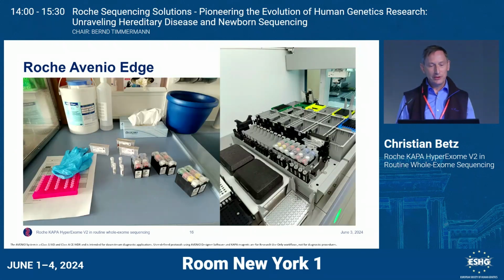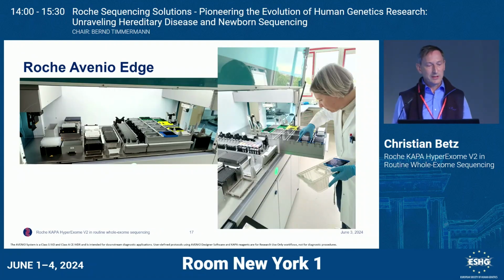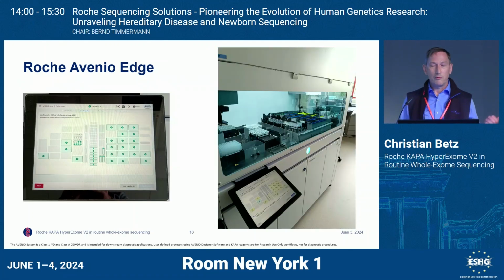It uses cartridges for almost everything. They are color-coded with the reagents and also bar-coded, so the instrument can check their correct loading and positioning. And once this is done, a test run with the scanner makes sure that everything is loaded the way the instrument expects it to be loaded. To avoid errors later in the run, you get nice signal lights, like a green, meaning everything passes and can start.